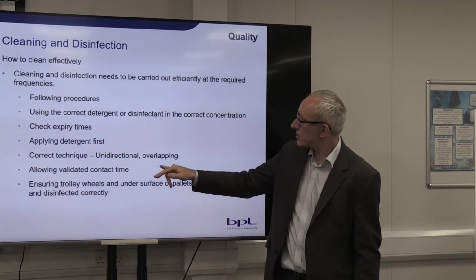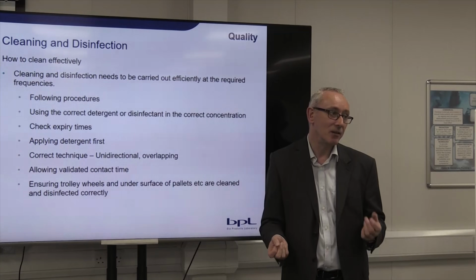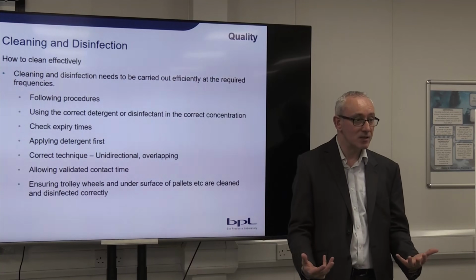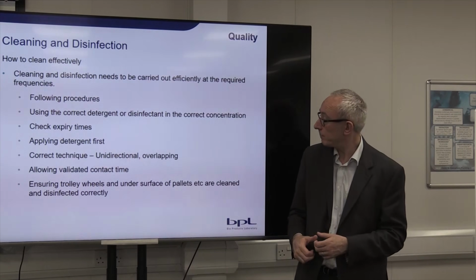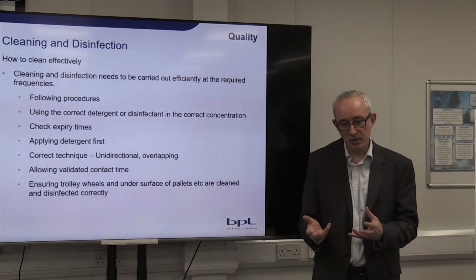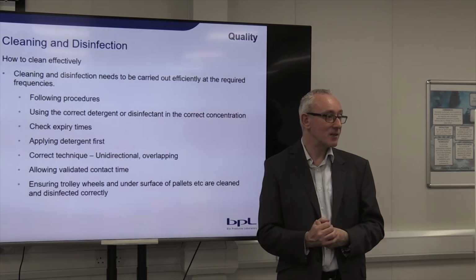There's also the importance of contact time. All of the disinfectants have been experimentally tested to say that this one might need 5 minutes to kill bacteria. So if you're going to apply it, you need to wait 5 minutes, and if it starts drying out, you might need to do a new application of that. Another area of concern is when you're moving, say, trolleys or carts from one room to another. One of the big sources of contamination are the wheels. You need to make sure those wheels are correctly cleaned and disinfected.